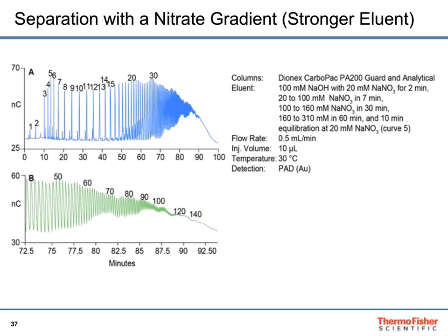In this case, this is application note 1013, and you can see that work there. But again, in this case, we're using nitrate as an eluent, which, for highly charged things, is something we can do.